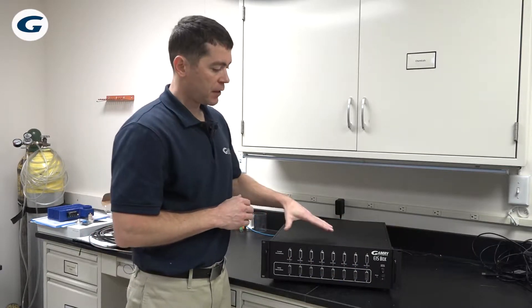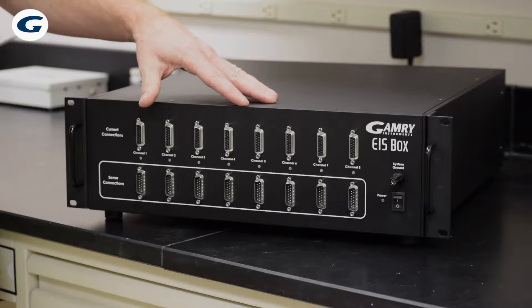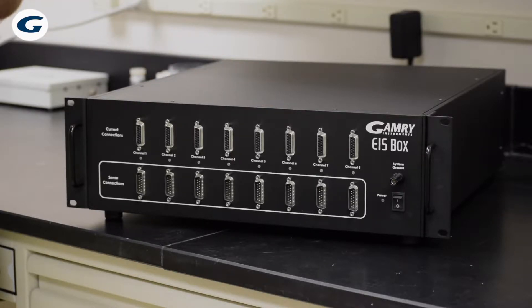Hello, I'm Chris Beasley with Gamry Instruments, and in this video I want to introduce you to Gamry's newest product, the EIS Box, or what we call it as the Ice Box. This is an 8-channel device meant to measure impedance on batteries or fuel cells or supercapacitors.